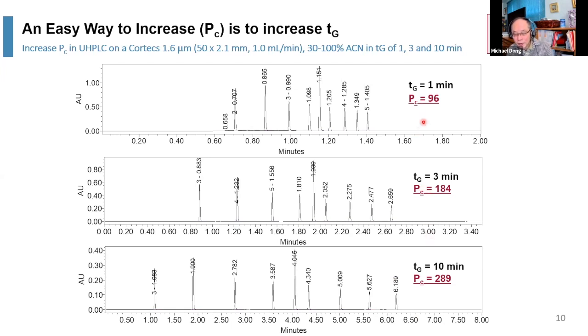And you can see how powerful it is by changing the gradient time. You can have a very fast analysis with good resolution. You can have a longer separation with very good resolution. And the gradient time actually is not too bad, it's 10 minutes.